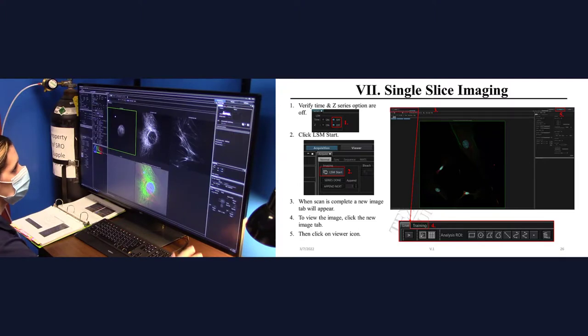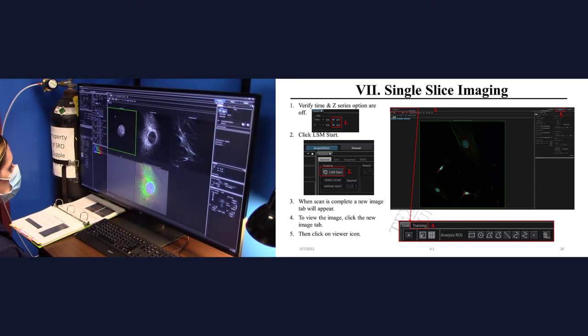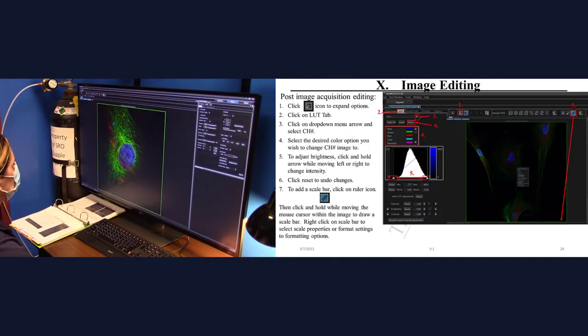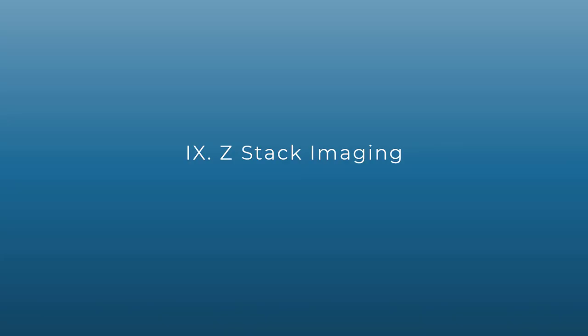Take a single slice image by clicking LSM Start. Once the micrograph has acquired, click on the Viewer button in the upper right-hand corner. Demonstrate how to change the view of the image. Add a scale bar. Under the Lookup Tables or LUT tool, you are able to change the color of the different channels in the micrograph.